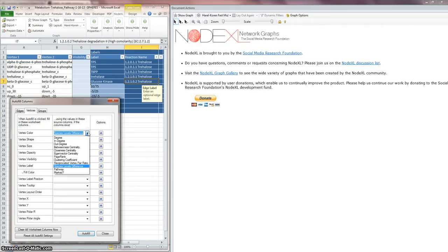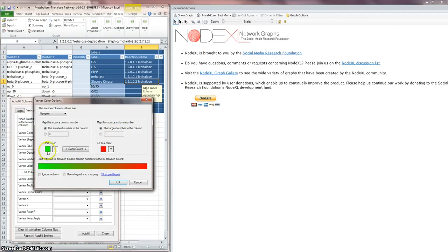So you simply just select the column label of the variable that you want to use to determine this. There are options. The standard is green down and red up. I wish this would let you force it to have white or yellow as 0 to meet that standard. This is where setting up your low and high scalar based upon the data ranges that you have becomes important, to have this separation, to have a 0 change fall somewhere in here. If the programmers ever get to watch this, I hope you listen to me and put that in there for this very important function.